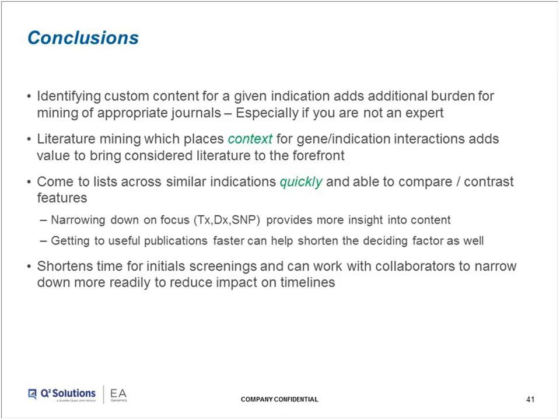and after that screening is done, as I discussed, we're able to go back and say, here's your panel list. Okay, if we include these top 100 markers, not necessarily genes, but markers, your panel is going to be this size. We can run this many samples at a time. It's going to cost this much, and it allows us to start looking at some economic and actionable decision criteria for creating that panel, which is really great.